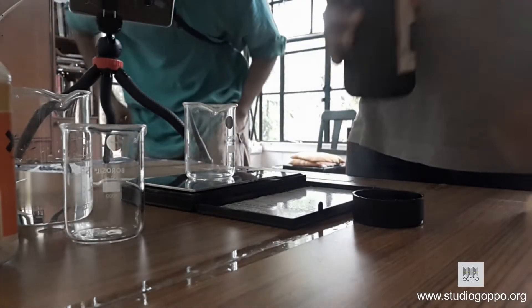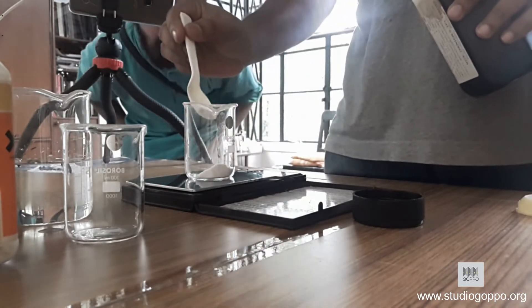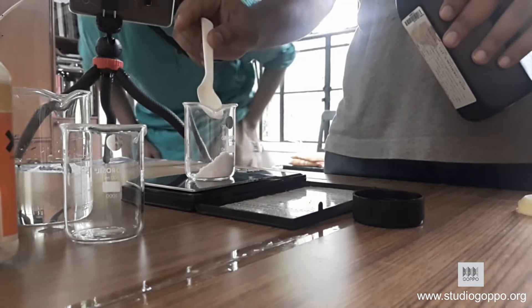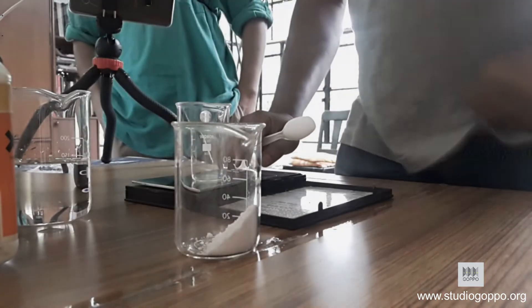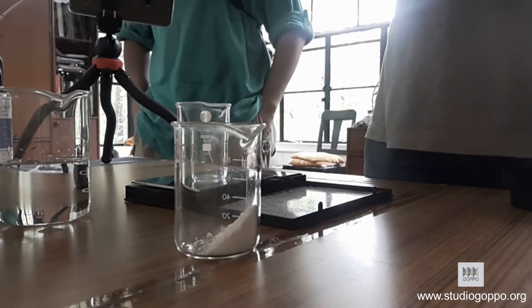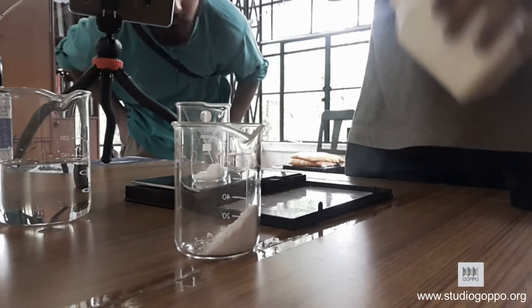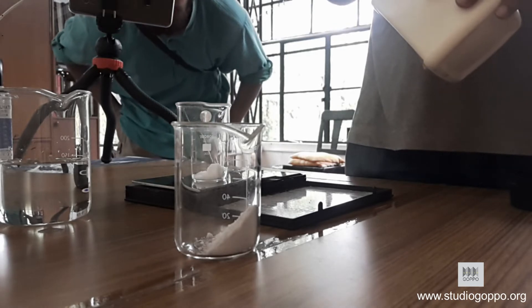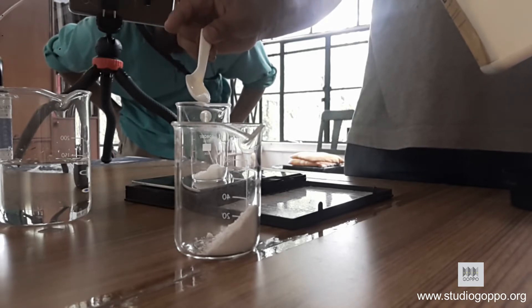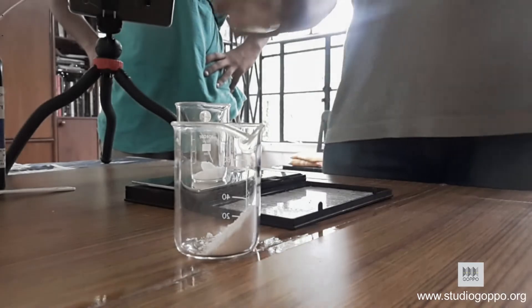We are measuring 5 grams of ferric sulphate. We will also make a 10% solution of oxalic acid — that is 5 grams of oxalic acid plus 50 ml of water.